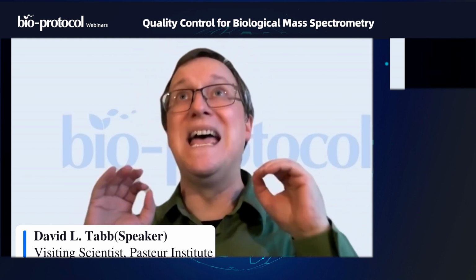The trouble is in proteomics, the missing values tend to be where you have very, very low intensity, which means they're not missing at random. They're missing not at random, MNAR. And imputation doesn't deal well with that at all.